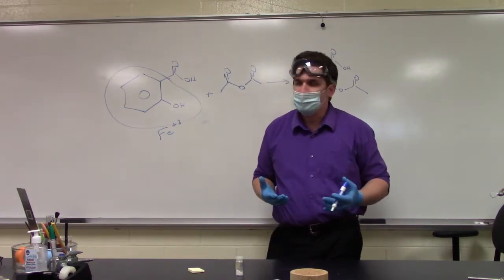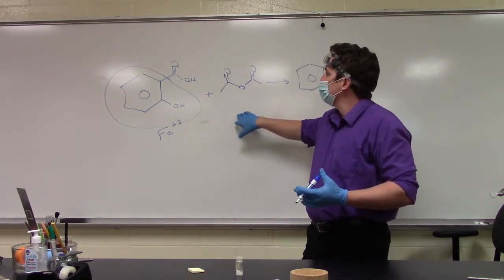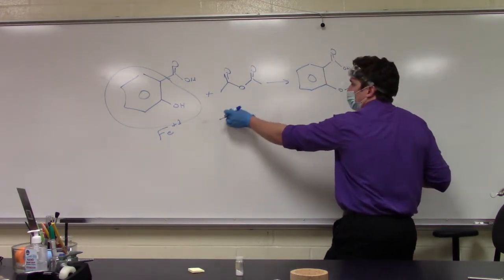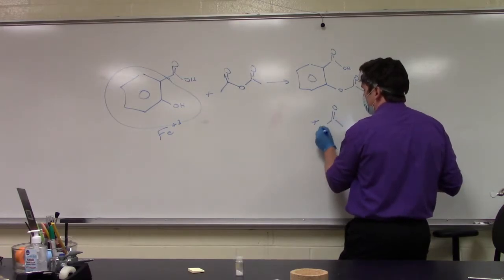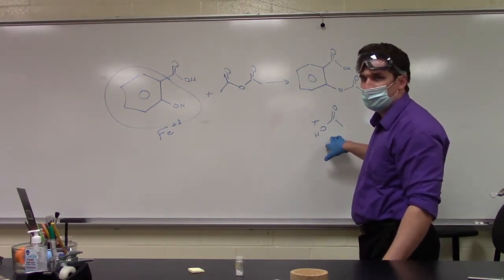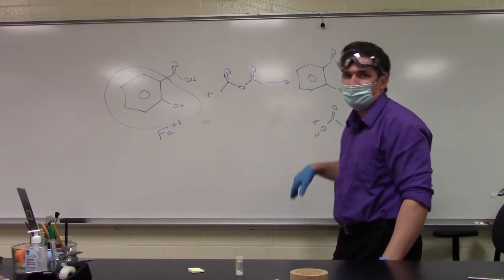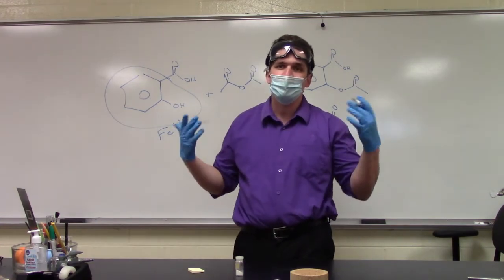It's a very simple experiment, but basically we're taking salicylic acid, reacting with acetic anhydride, and we're getting the replacement of the phenol with an ester, and the other product here is our acetic acid. This is very soluble in water. This is sparingly soluble. So they're also very easy to separate. And yes, this was a beautiful example of chemistry in motion.